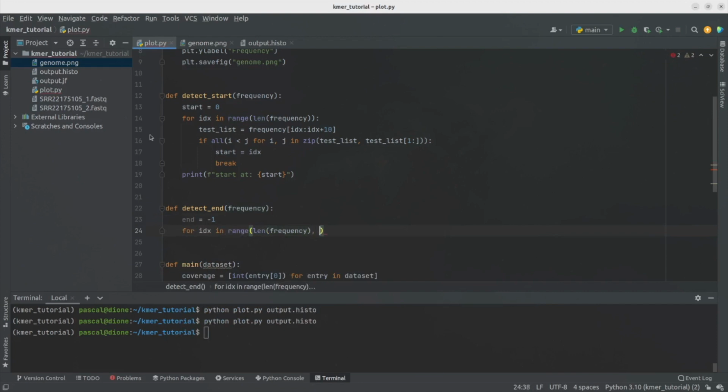But now we need to make a countdown. So we are not going from this case, let's say that the list is 100 in length. We are going from 0, 1, 2, 3, 4 until 100. So now we need to do the opposite. So we start at 100 and go decreasing. So this is the structure for doing that with range. So just give a -1, -1 here.